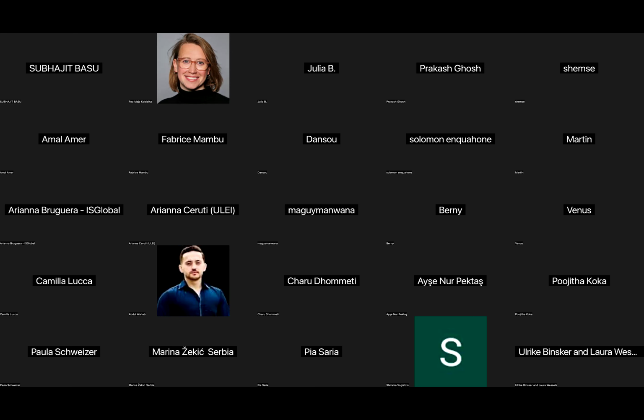I think we have to wait until Oxford Nanopore adds another workflow for metagenome assembly, something like that. Still, with this workflow, we can only do limited work regarding the bacterial genome. Okay, thank you. Please carry on, and thanks for the very nice presentation. Thank you.